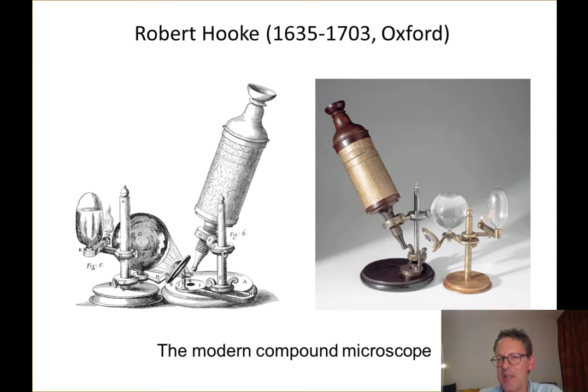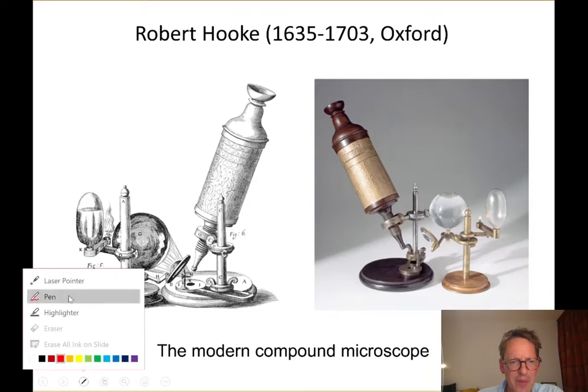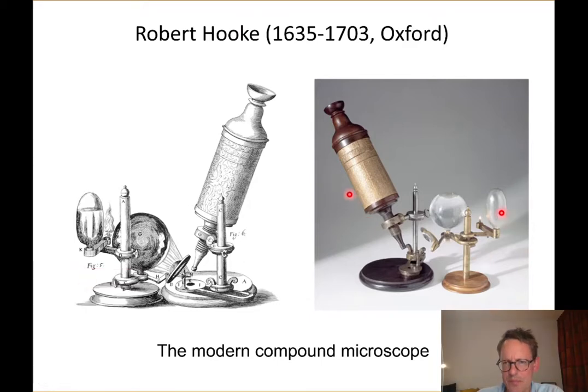And you see here there's a flame, and this flame acts as a light source. So on the right here there is a container of paraffin that fuels the flame, and the light from the flame is then thrown onto the sample holder, which you can't see here on this image very well. It's a pin containing the sample, and this bulb here filled with water acts as a lens, and so the light is focused through this lens and this lens down here onto the sample.